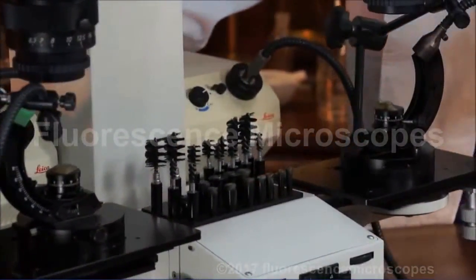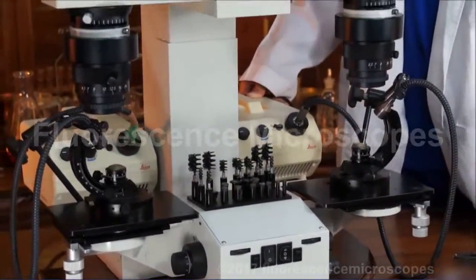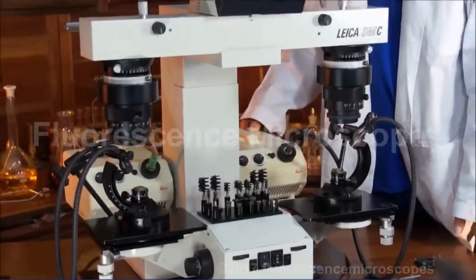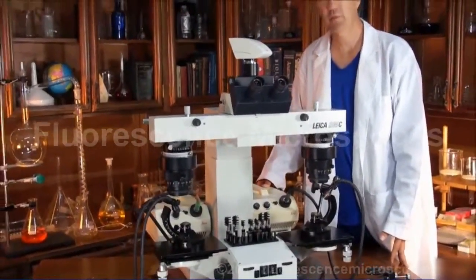If you've got any questions about this microscope, please give us a call. Leica DMC Forensic Comparison Macroscope — mainly used for bullet comparison. Thank you.